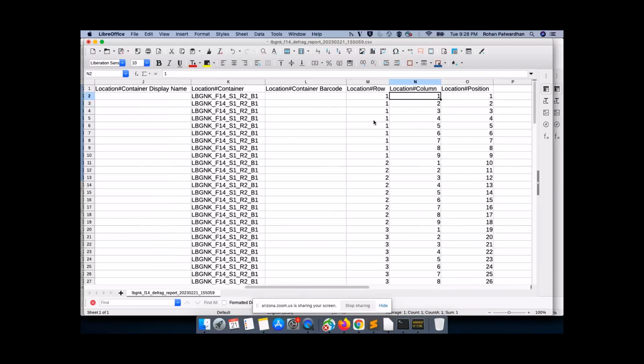The system is going to preserve all the sequences, and it will put all the specimens from the same primary specimens together. But in case you still think, oh no, this doesn't look right, I need to change these positions, then even that can be achieved via this simple Excel. Okay, thank you.